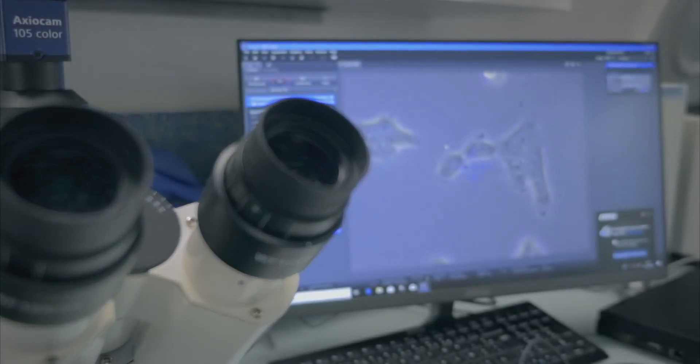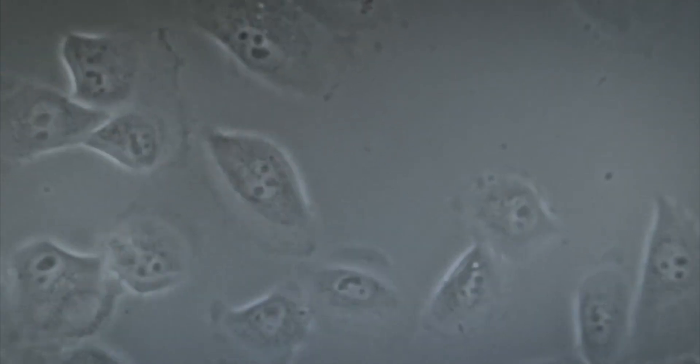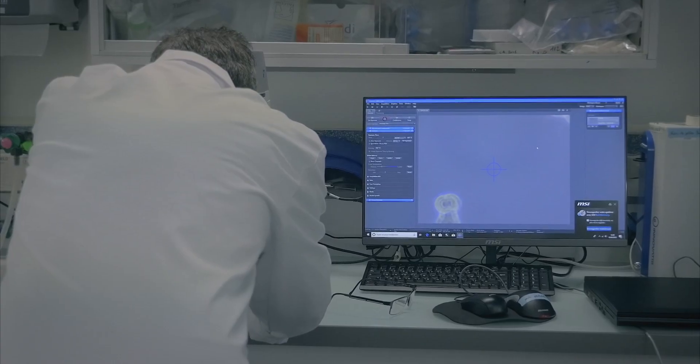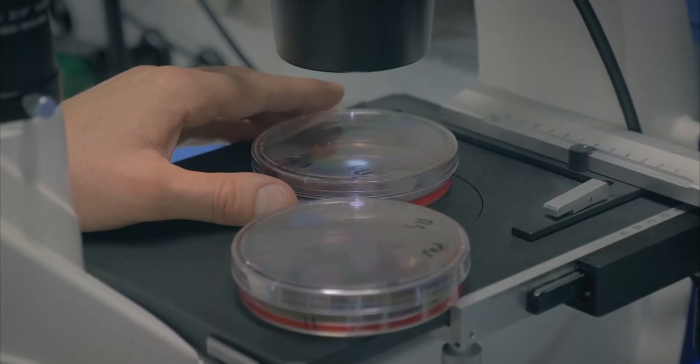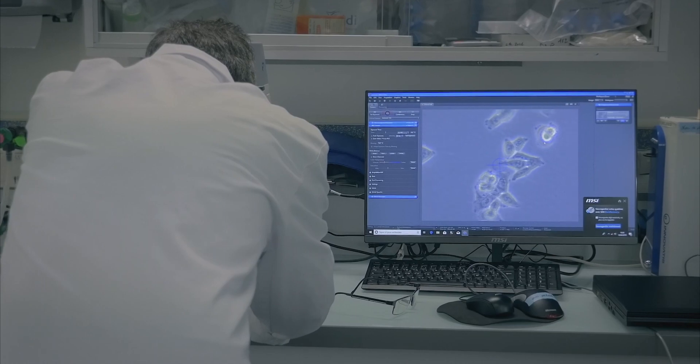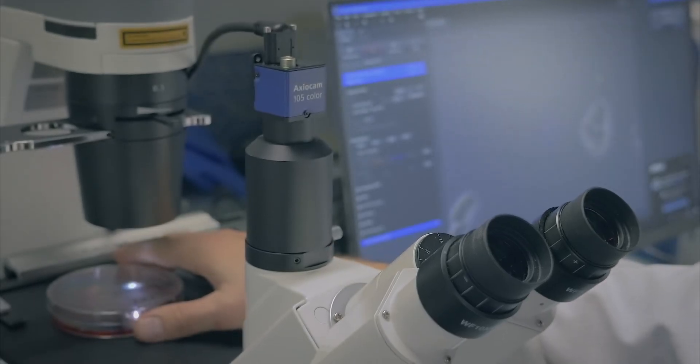The signal is very rich, so we measure a lot of things that we have never measured. Brillouin microscopy allows us to paint a more comprehensive picture of how cells work and give us valuable insight into the origins and means of treating diseases.